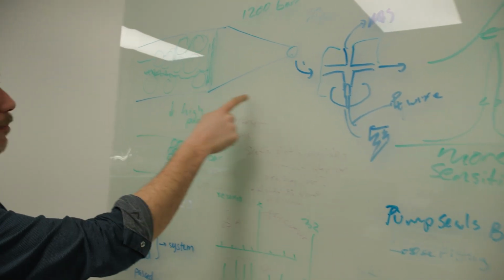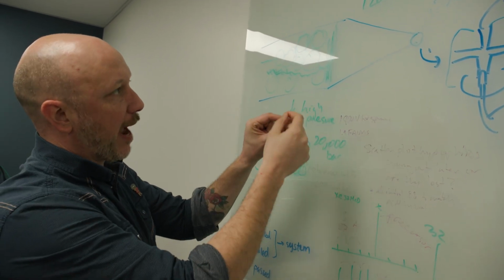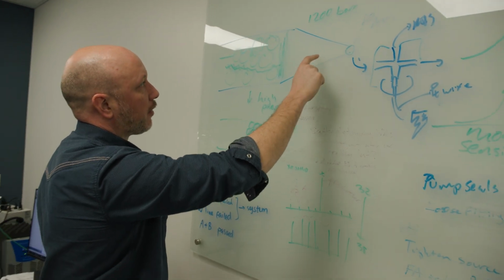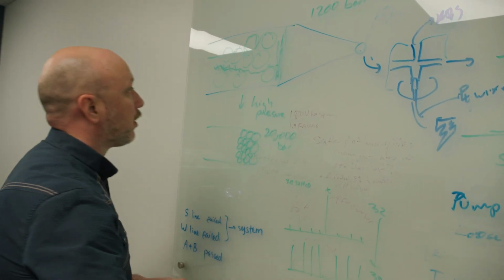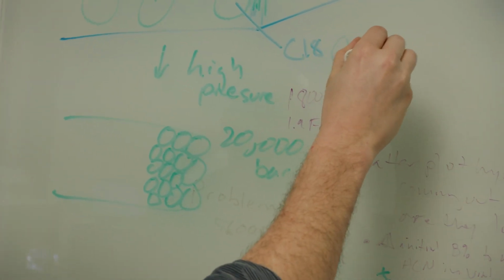So basically this is like a big zoom in of this emitter tip, that really sharp capillary I was showing you. So here the opening is only about 10 microns, right? And what we do is we pack these C18 particles, which is hydrophobic.